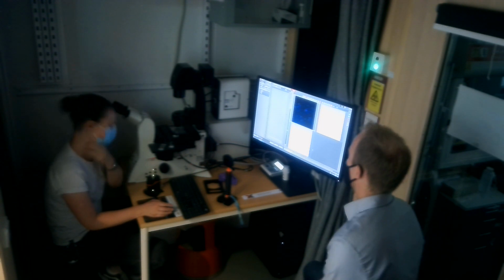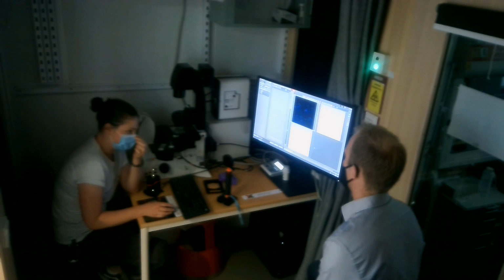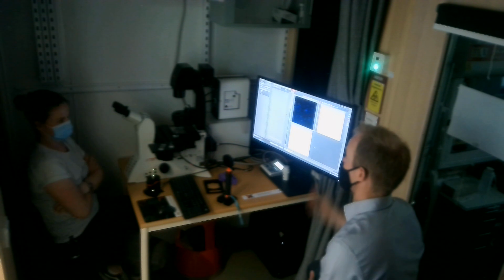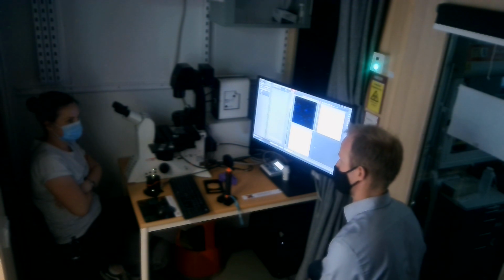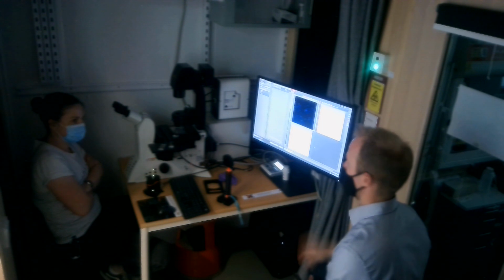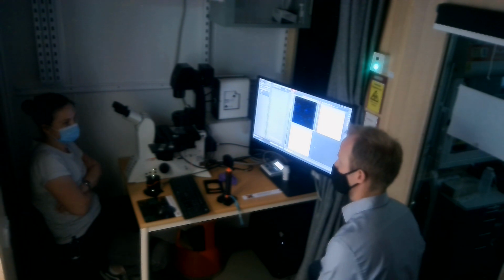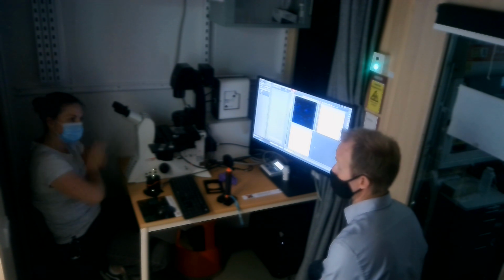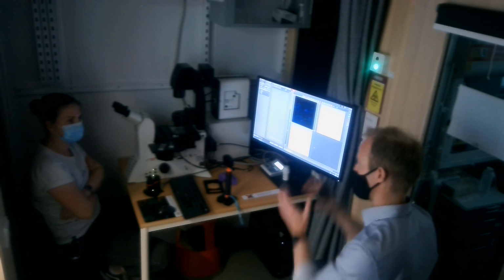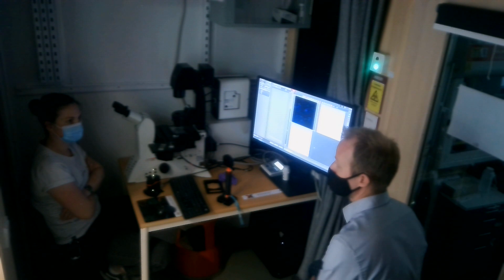But yeah, I think that if you have another stain anywhere else, even if this is quite broad and it has the excitation over here and then the emission quite far away, because this is so bright. Yeah, because the LED is at just 4 or 5%. So as long as you're not exciting this fluorophore, you will have no interference from anything. Do you think it would make sense to look for a DNA stain with the other filter cube, for example? I would probably use the same, but if you can get something in the red or far red, somewhere like Cy3, Alexa 555, or up towards even Cy5 or something like that. I don't know which one.